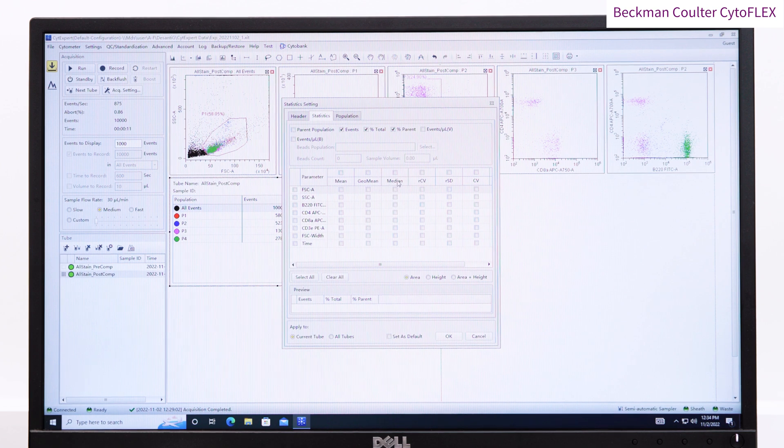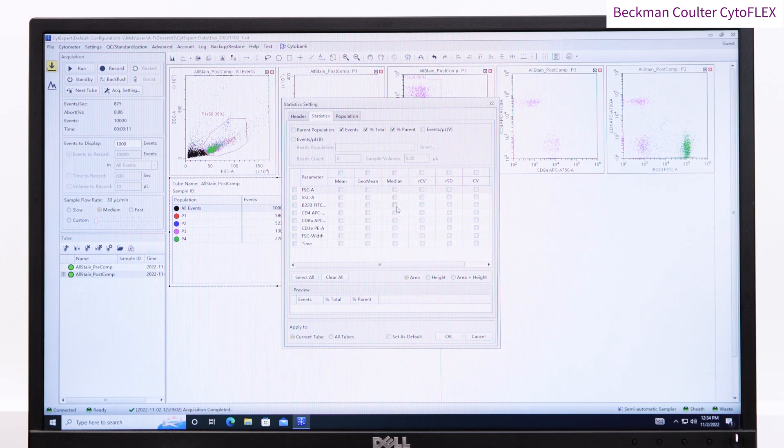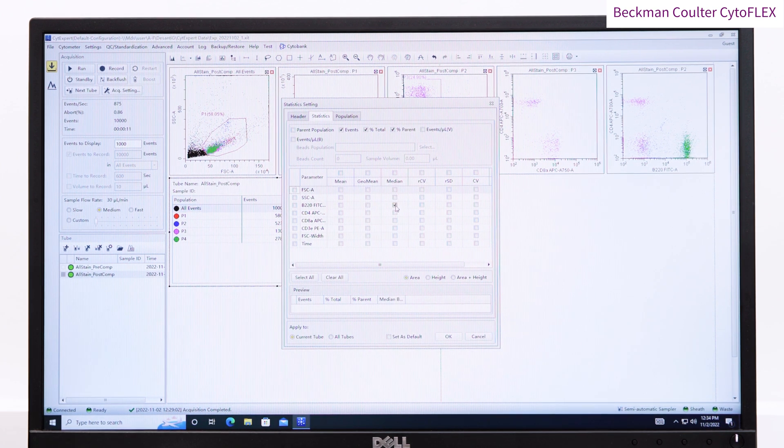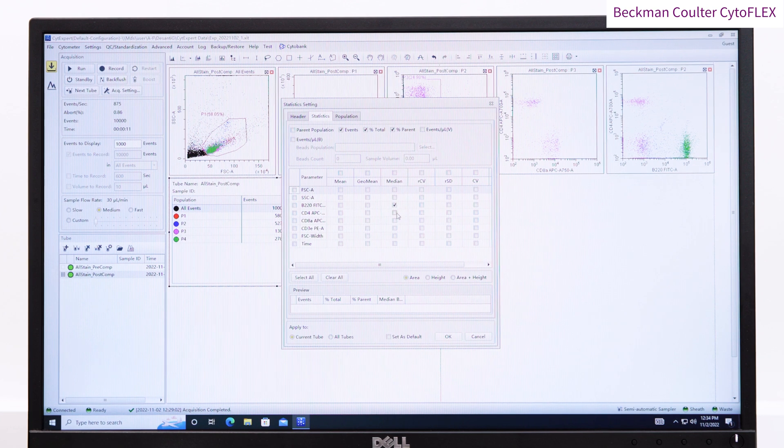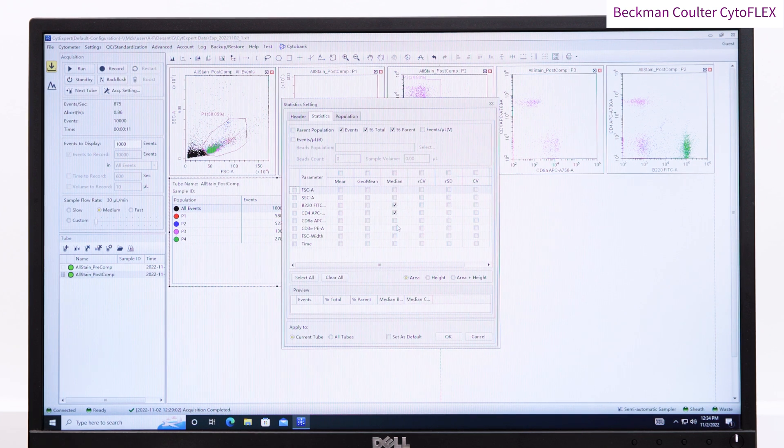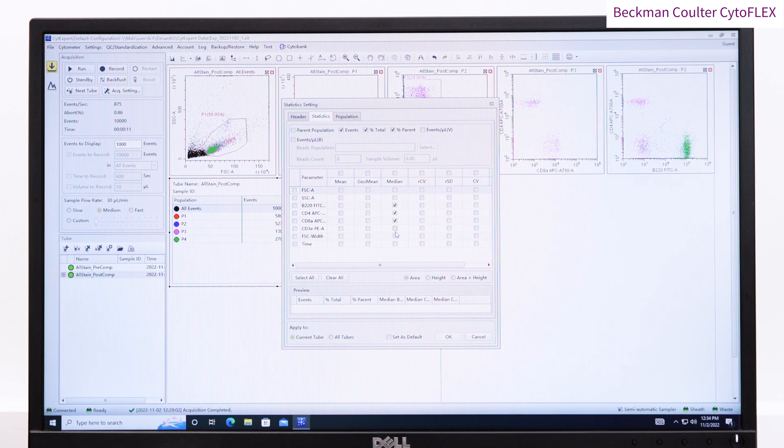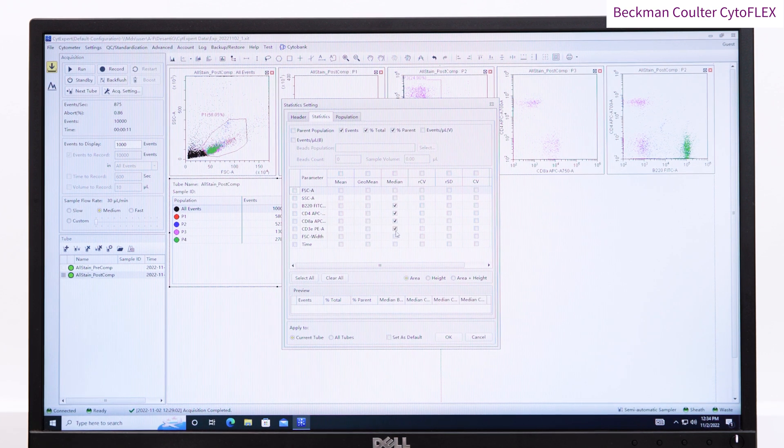Statistics can be directly exported by right-clicking on the table and pressing export to CSV. All results can be saved directly to PDF through the print menu.